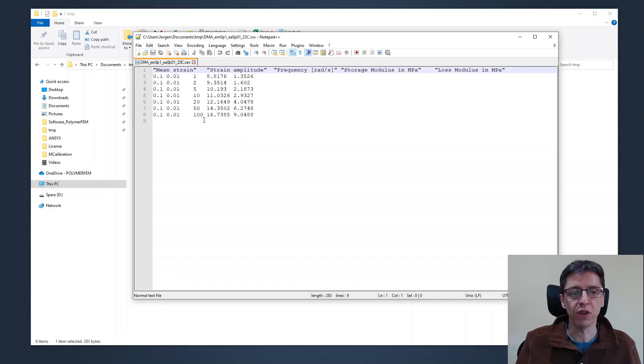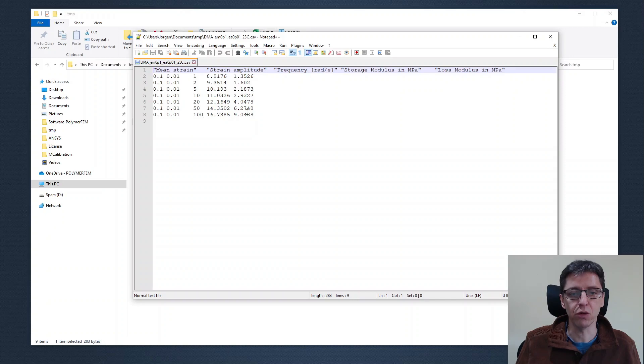The first three are, as we discussed a few minutes ago, the input to the test and the last two are the measured quantities, the storage and the loss modulus.